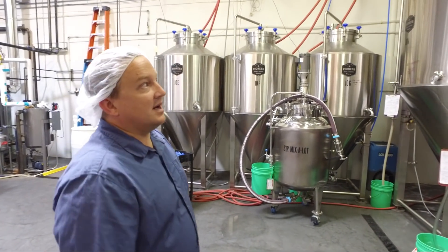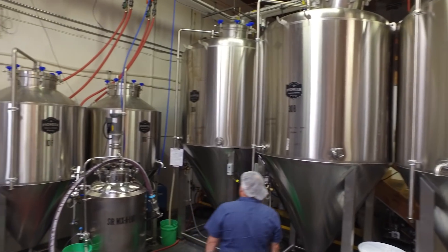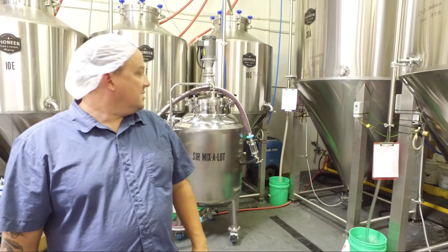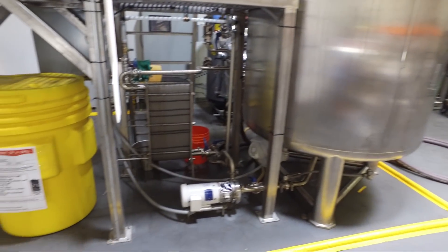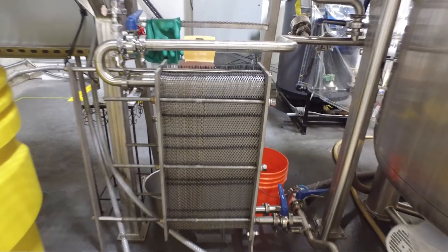Here's our second production area that we're just moving into — this has been this year's project. We had professionals come in and do glycol instead of myself. We have a lot of automation we're putting in for being able to time glycol and air shutoff. Here are our new tanks — about half of these are operational. Two of the 30s have been running, the new 30 needs some fixing, one 10 is running, and the other 10s will hopefully be operational next week. We're running juice and flagship in here. Looks like the flagship is finishing out at about 30 and a quarter barrels in the tank — probably harvesting that tomorrow. And here's our new kettle: 23 barrel versus 5 barrel, so we're about a 5x increase on the hot side.